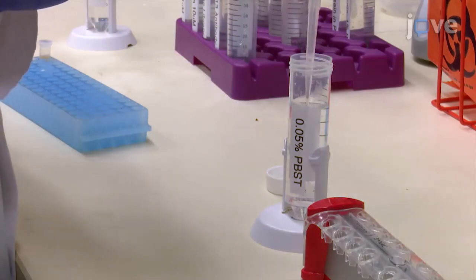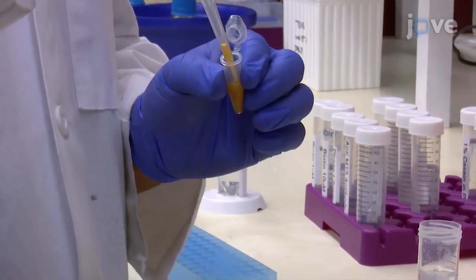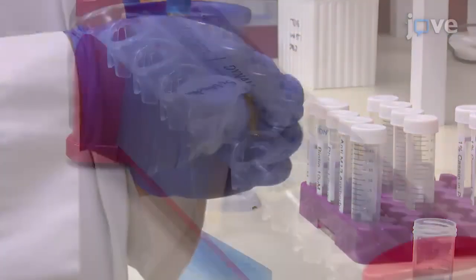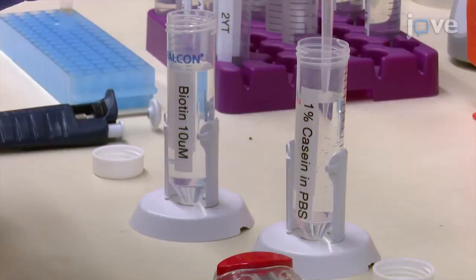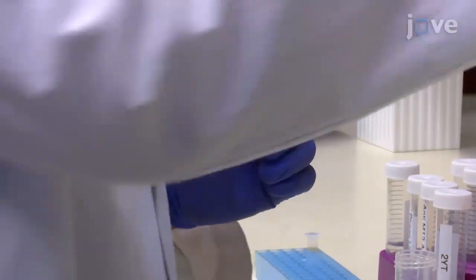To prepare the negative selection beads, wash 300 microliters of streptavidin-coated magnetic beads three times with 1 milliliter of 0.05 percent PBS-Tween buffer and two times with one milliliter of PBS per wash on a magnetic separation rack. Resuspend the beads with one milliliter of one percent casein in PBS and saturate the beads with biotin at five times the reported binding capacity of the beads.